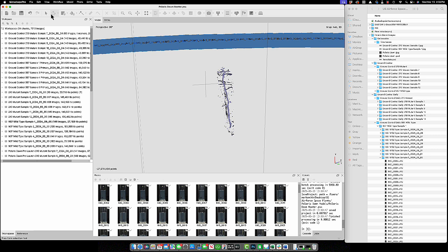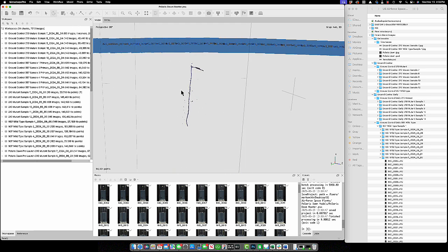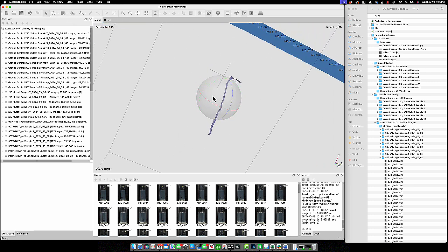So I'll crop out that section of the root, and then we'll clean up that section of the root. The top is a bit irrelevant, that little overhang. That interface between air and agar is going to be really difficult to reveal that pathway, so it's not one we're so concerned about. We're really concerned about what the roots are doing at depth. But I leave them just in case it does give us some data about where the root has come from relative to the actual plant. Okay, so that's essentially what I've been doing in terms of a deliverable.